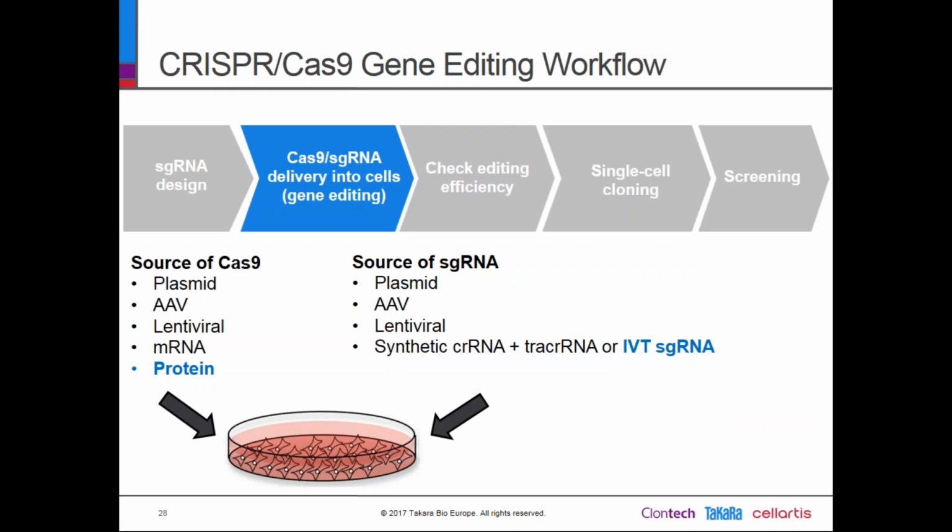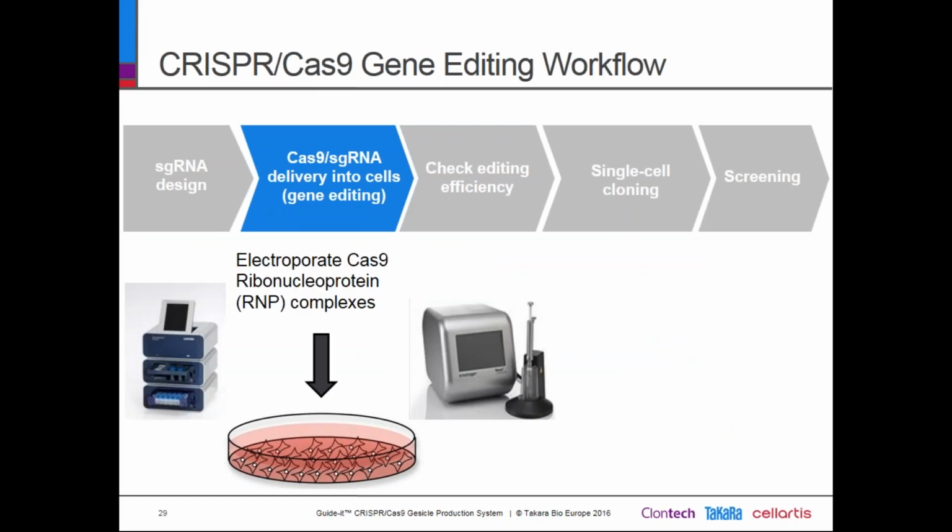Now I would like to present you the second method to deliver Cas9 protein together with in vitro transcribed guide RNAs. And this is electroporation of recombinant Cas9.